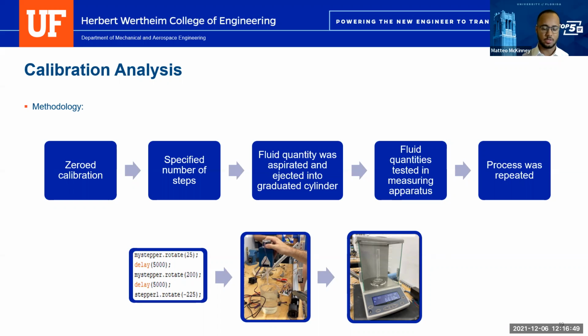What we found was, in order to properly dispense all of the liquid, we needed to create a small air cushion, as highlighted in the code. And so we were able to take in that small amount of air, then take in the fluid volume that we needed, and then dispense all of it like that, so that every drop was able to properly eject.